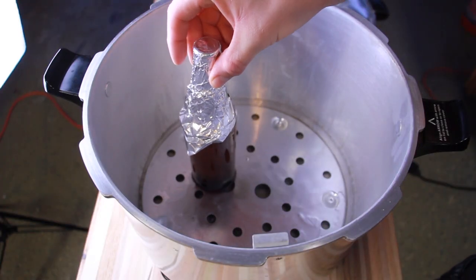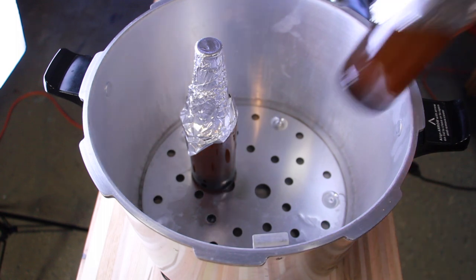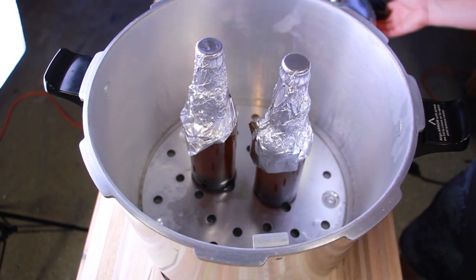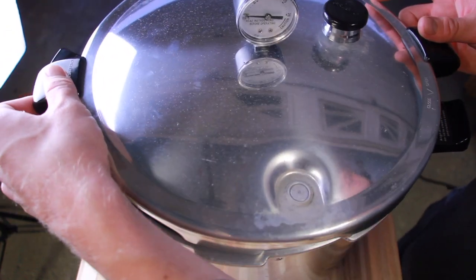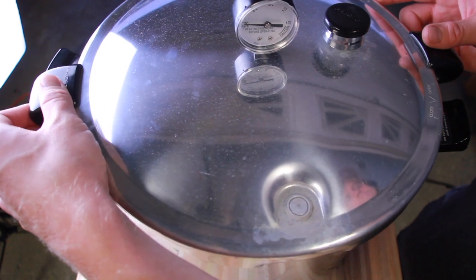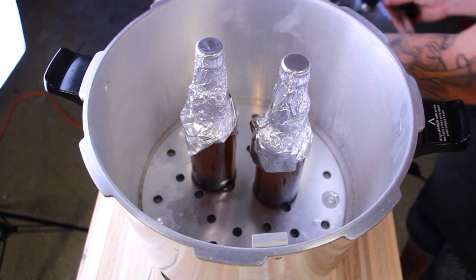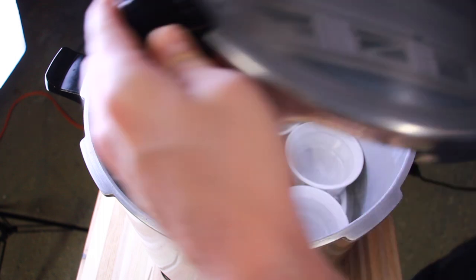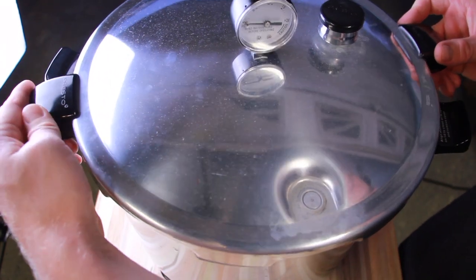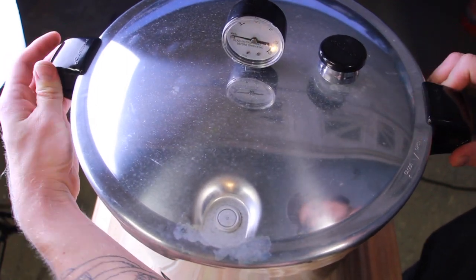And then loaded them into the pressure cooker. Now, I'm sure you can already figure this out, but they don't fit standing up. And I'm actually kind of glad they didn't, because now looking back at it, having them stand up like that right next to the vent and the gauge, I could have potentially blocked the gauge or the vent, which could be dangerous. So I set them sideways and used a few items out of the kitchen to stop them from rolling around and falling over. And then I cranked up the heat and let it pressure cook for 15 minutes at 15 PSI.